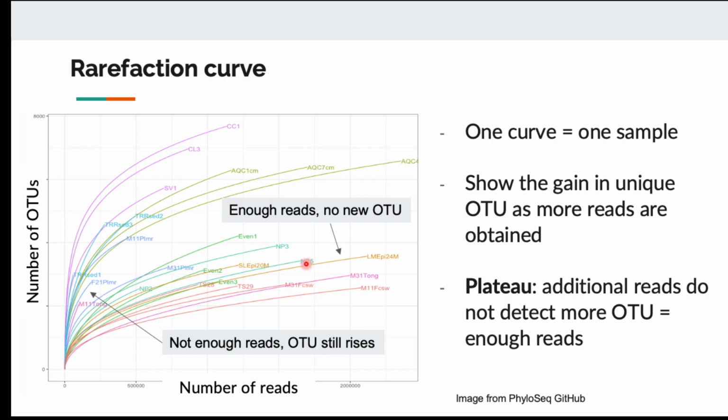This is very important because for a metagenomic sample, we never know what the complexity is, which species or how many pathogens we are expecting to see. So after you get the sequencing data, doing the rarefaction curve is very important for you to tell. Okay.